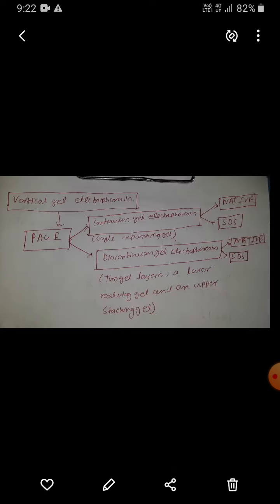So the separation is highly sensitive, and it can separate 2% differences in molecular mass, requires a small amount of sample, and has a stable chemically cross-linked gel. Disadvantages: poor band resolution due to a high alkaline operating pH. Acrylamide gel is a potent neurotoxin chemical. Gel preparation requires high time and is highly costly.